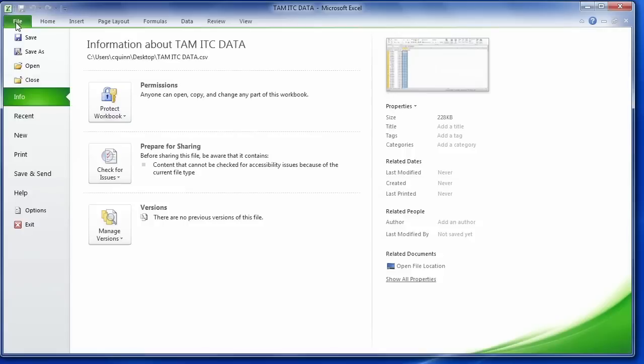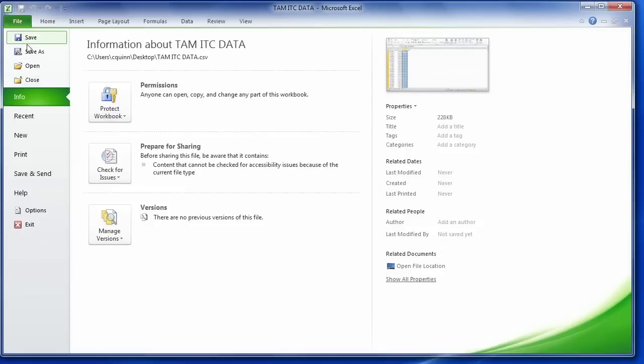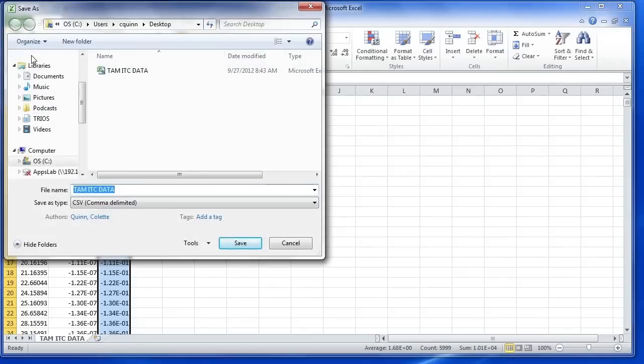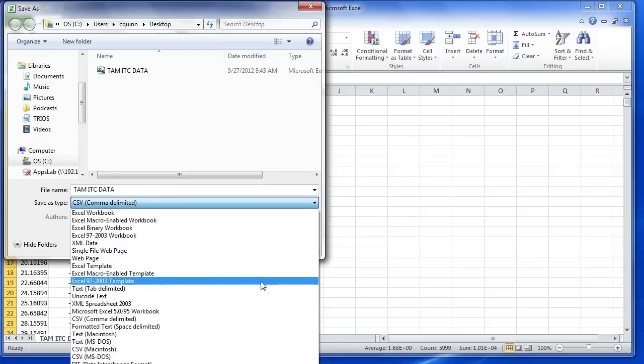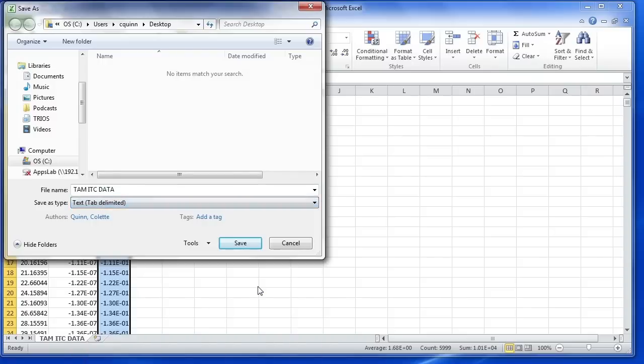Now the data can be saved. A comma delimited is an acceptable file format for NanoAnalyze, as well as many other text files, such as a text tab delimited.